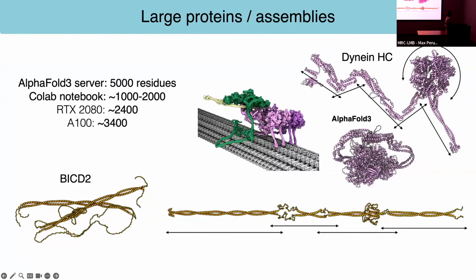I mean, you would want to cut at the edge of domains typically. You don't want to be exposing bits that would otherwise be buried. That would be my only suggestion. Otherwise, if you're doing something like this, you can see I've done overlapping regions, right? So you go beyond a bit, and then you start a little bit before, so that if you're stitching these things together, then you know how to stitch them together. Otherwise, you just have to try. Well, it depends what you're doing.